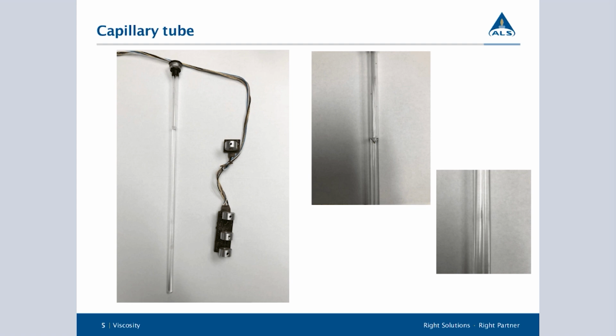So we'll drop that oil sample into the tube and heat it to 40 degrees C or 100 degrees C, depending on which temperature we're running at. Once that temperature has been reached, the pressure releases so that fluid can start flowing. As it flows, you have these three sensors down here, which are all equidistant. I know the picture doesn't do a very good job of showing the distance between them. It times the flow between each sensor, and you can then get your viscosity in centistokes. This is the last, very thin portion, and then it exits out the bottom. That's how we look at our capillary tube and measure that one.